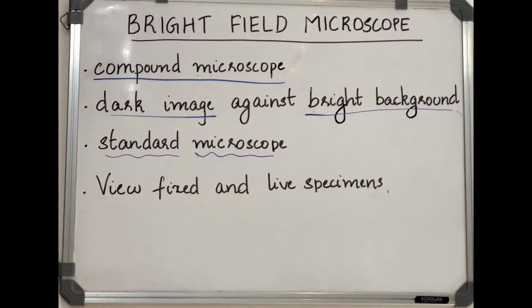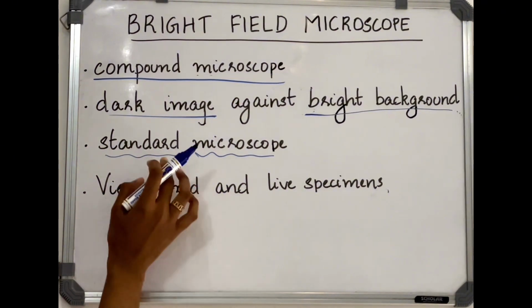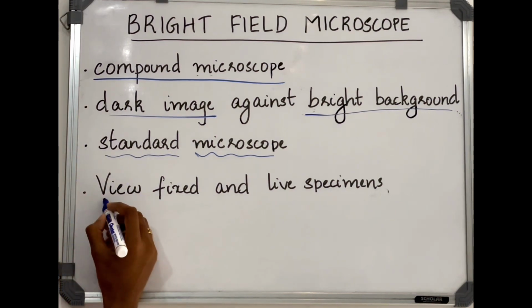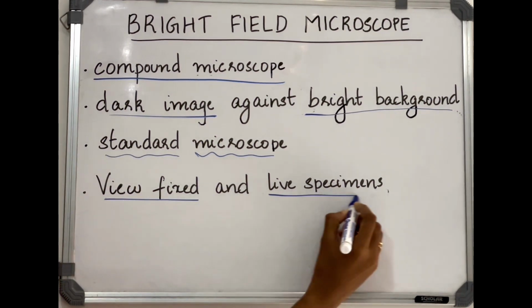This microscope is used in biology, cellular biology as well as microbiology laboratories, and it is used to view fixed and live specimens.